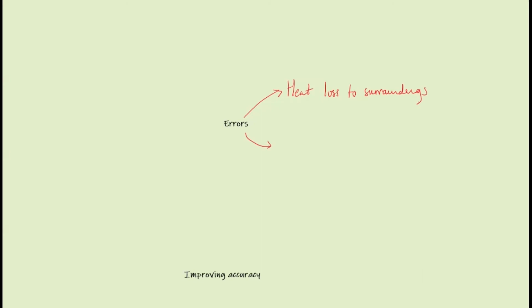Second one, if we're looking at combustion reactions using the copper cup calorimeter, it's incomplete combustion. So that basically means I'm going to get soot or carbon monoxide from a combustion reaction, which means that not all the fuel is combusted properly, or fully, I should say, in excess oxygen. So we don't have complete combustion. So incomplete combustion is the other one.